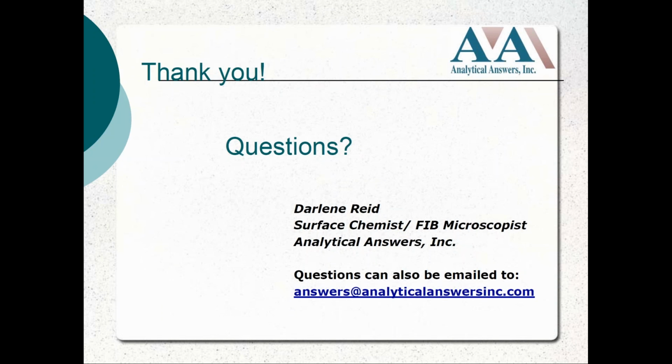We have a quick question here coming in from Nick. Are any of these techniques suitable for powders? Darlene? So ESCA can be used to analyze powders. We do have a special holder for them, but as long as it doesn't outgas, then we can definitely analyze powders using ESCA analysis.